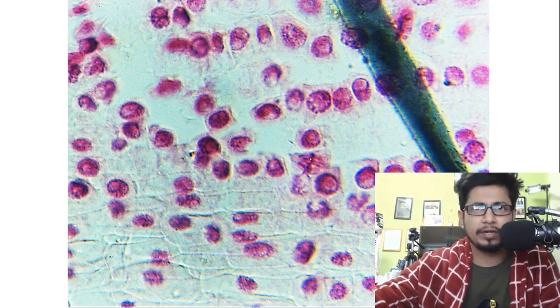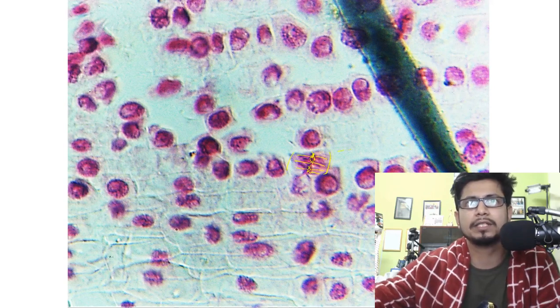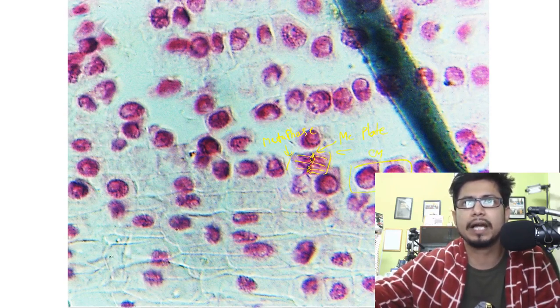In this highly contrasting image you can clearly see metaphase, where the chromosomes are aligned in the center and microtubules are connected throughout. This is the metaphase plate. And this is the telophase and cytokinesis.